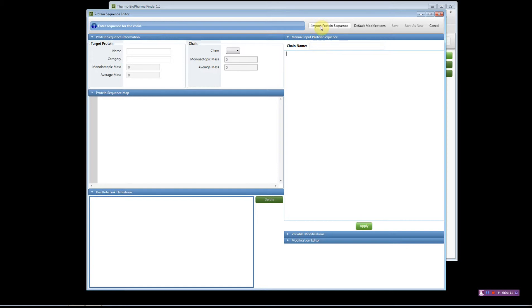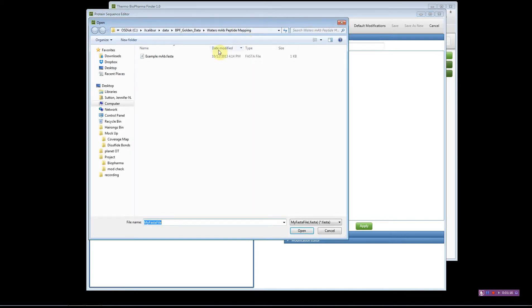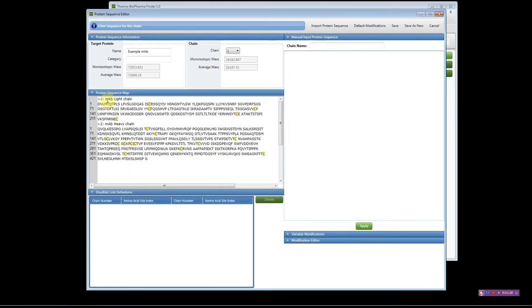I'll demonstrate how to import a protein sequence from a FASTA file. Click this button and you'll browse for a FASTA file. Here is an example FASTA file for an antibody. I'll highlight the FASTA file, click Open, and you'll see I have a light chain and a heavy chain.